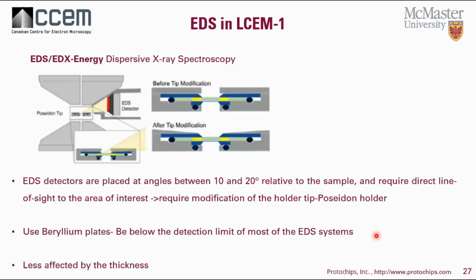So we're going to talk about the EDX now. EDX, the energy dispersive X-ray spectroscopy. When we do EDX in liquid cell microscopy, we have to do some modification of the holder. On the left image here, we have the upper and lower pole piece of a TEM objective lens. The EDX detector is situated at angles between 10 and 20 degrees relative to the sample.